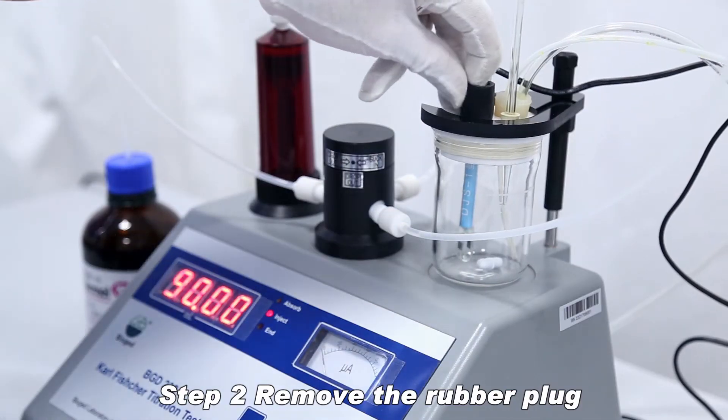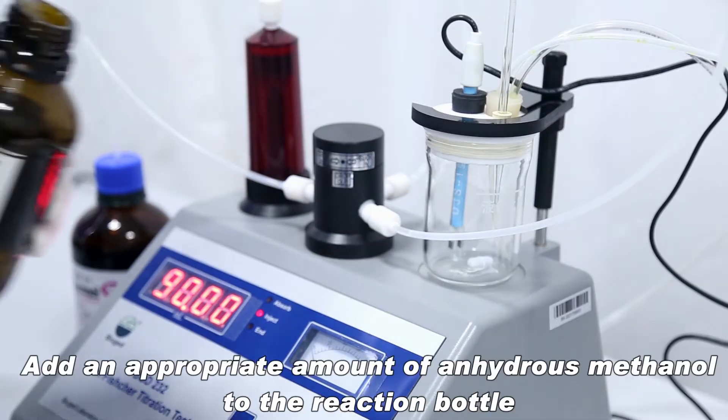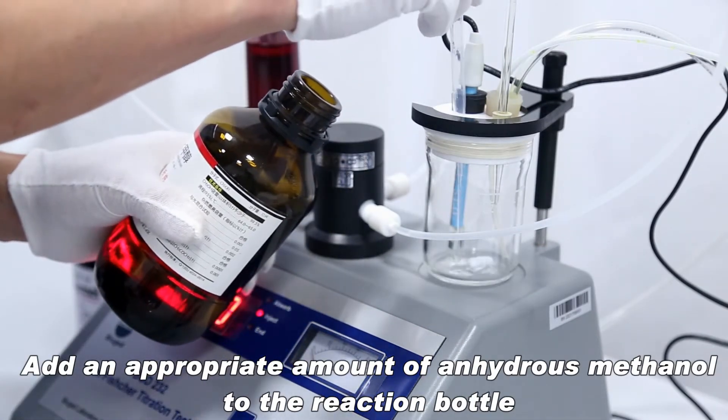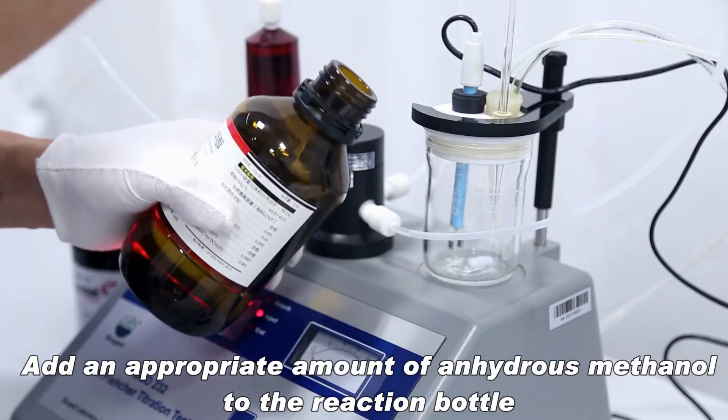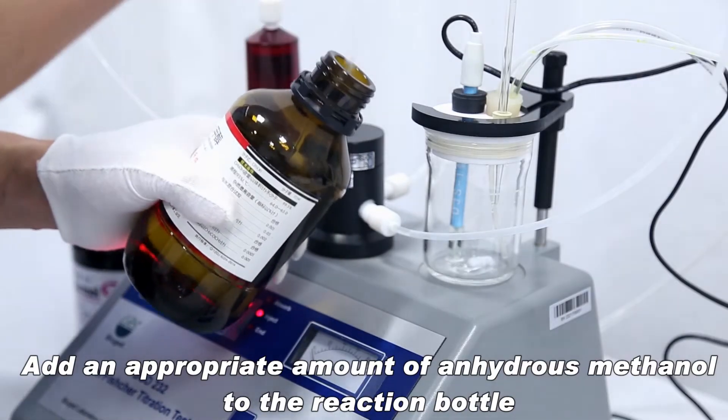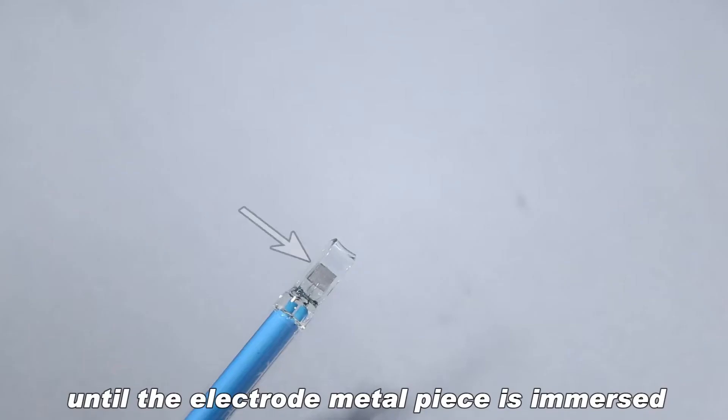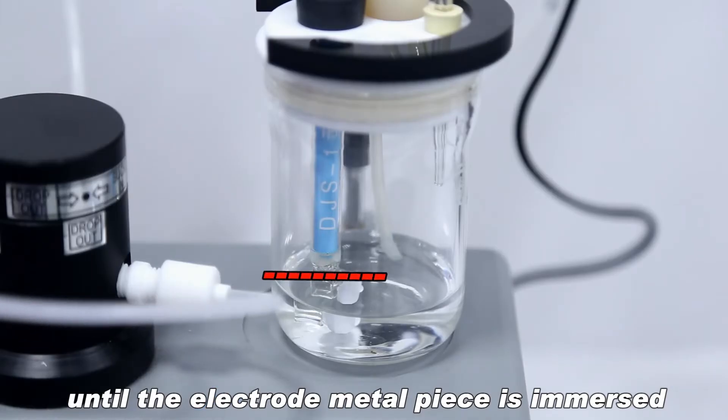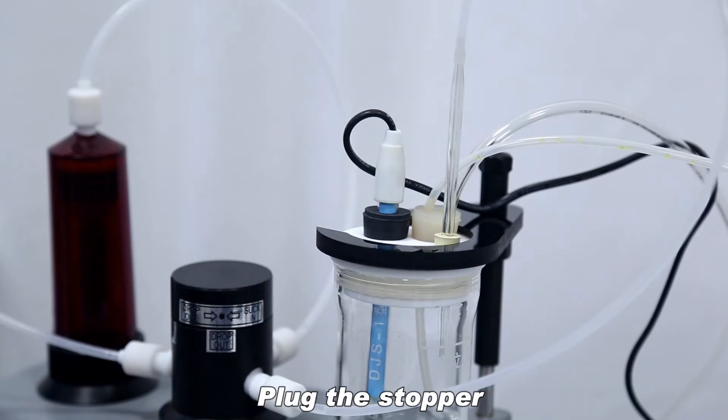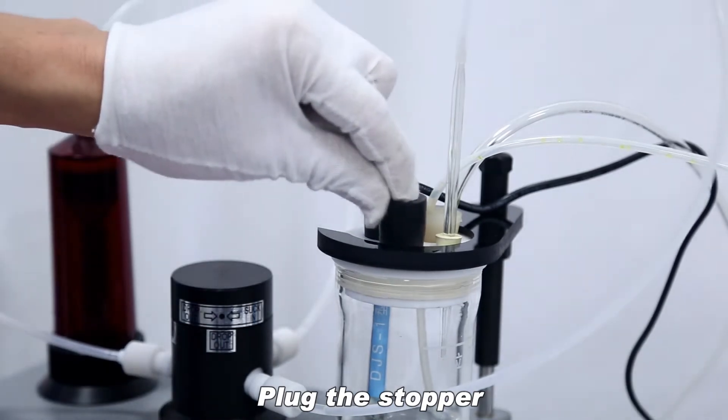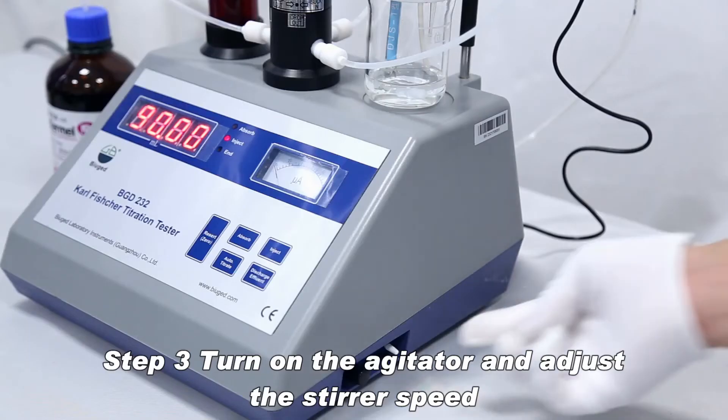Remove the rubber plug. Add an appropriate amount of anhydrous methanol to the reaction bottle until the electrode metal piece is immersed. Plug the stopper. Turn on the agitator and adjust the stirrer speed.